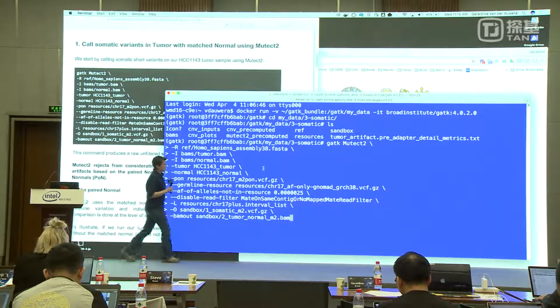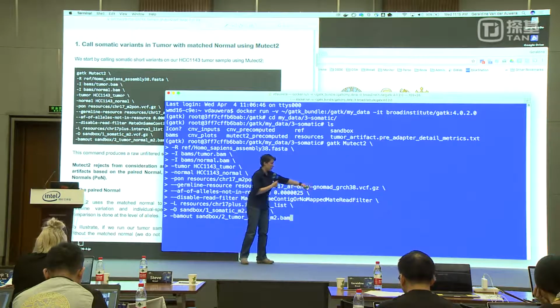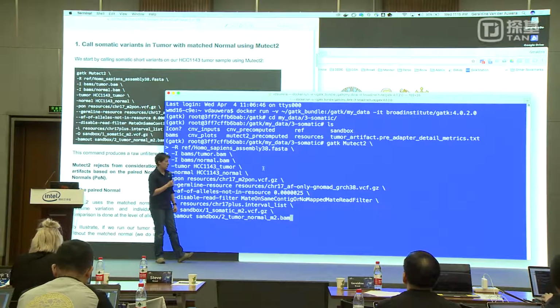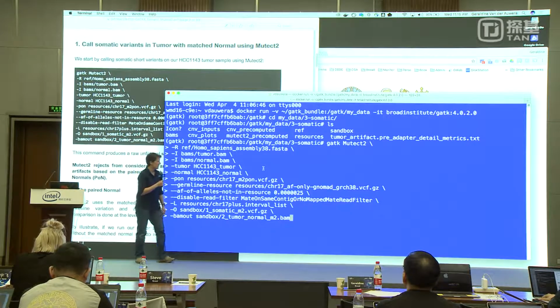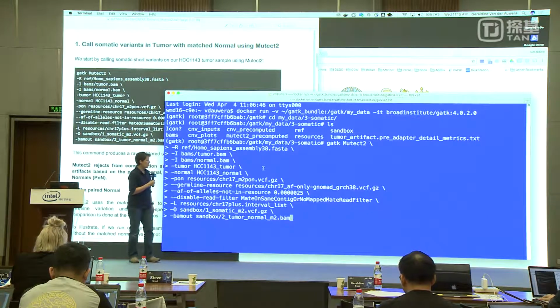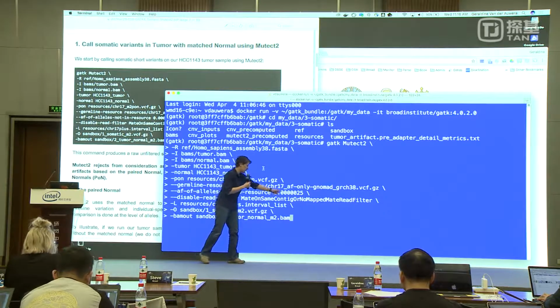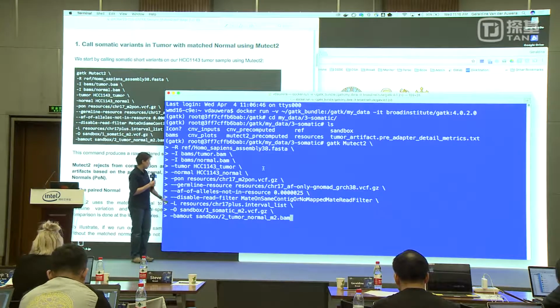Okay, so I was talking about how you divide that number. I have 200,000 samples in my gnomAD resource. Each of the samples contributes 2 alleles for each position, so that's 2 times 200,000, which is 400,000. I think there's a 2 that's added at some point, which is our sample, so that would be 400,000 and 2. And then you divide by that number, and I think we're dropping the 2 there, that gives you basically this number over here. And that is the allele frequency.